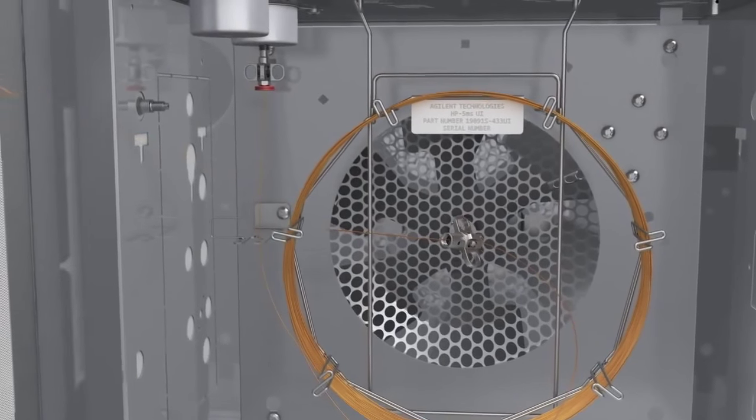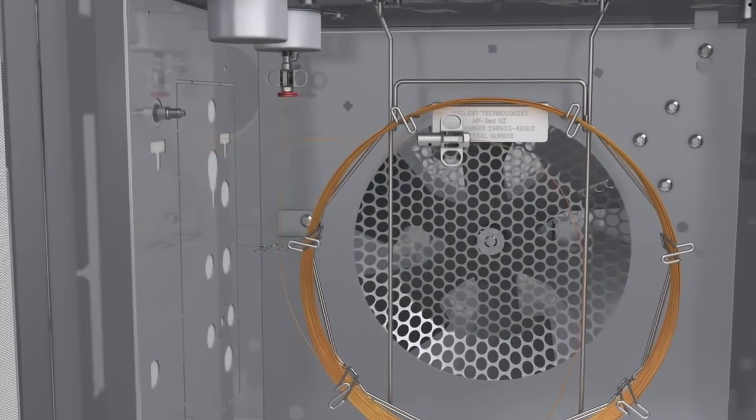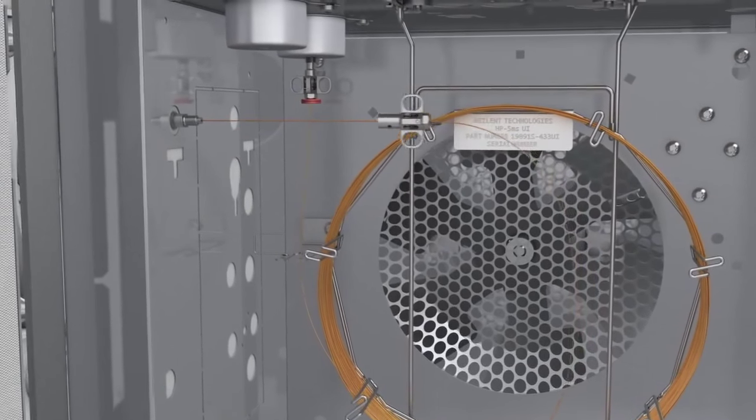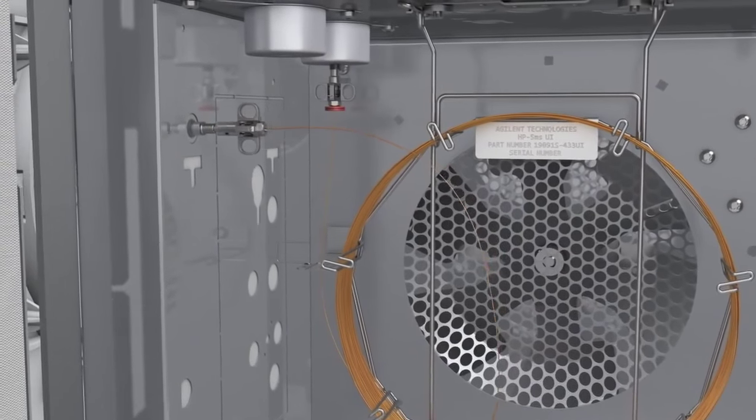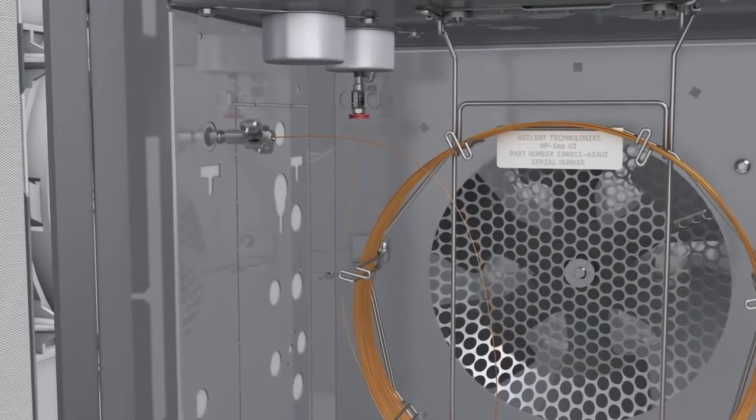When using a short graphite polyamide ferrule and the MS interface version of the self-tightening column nut, the MS interface fitting remains leak-free even after many cycles.